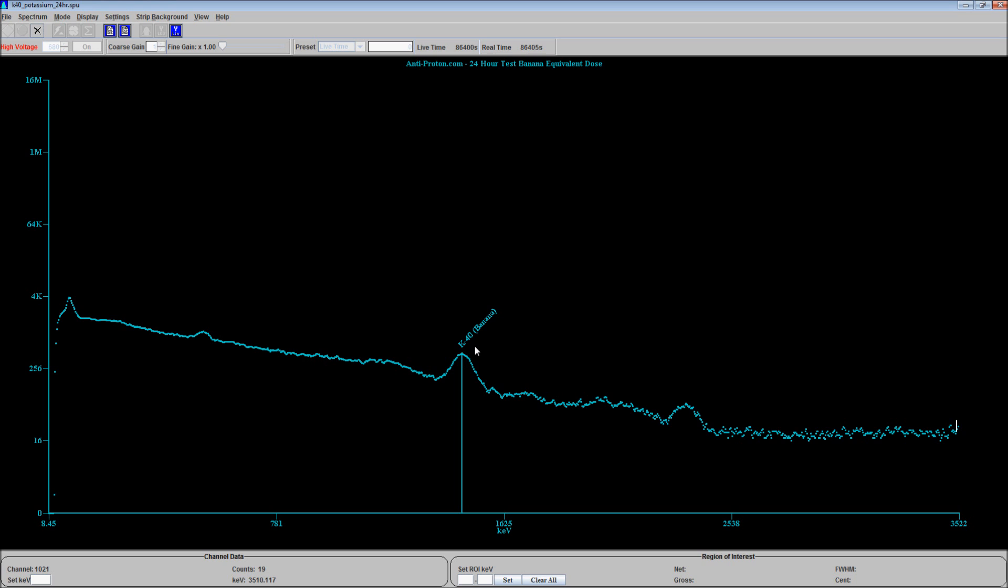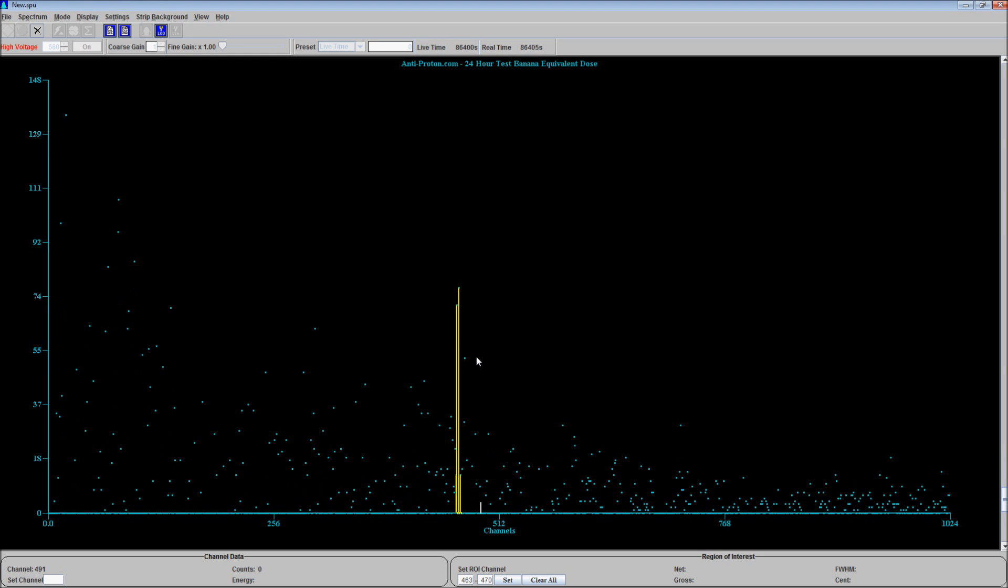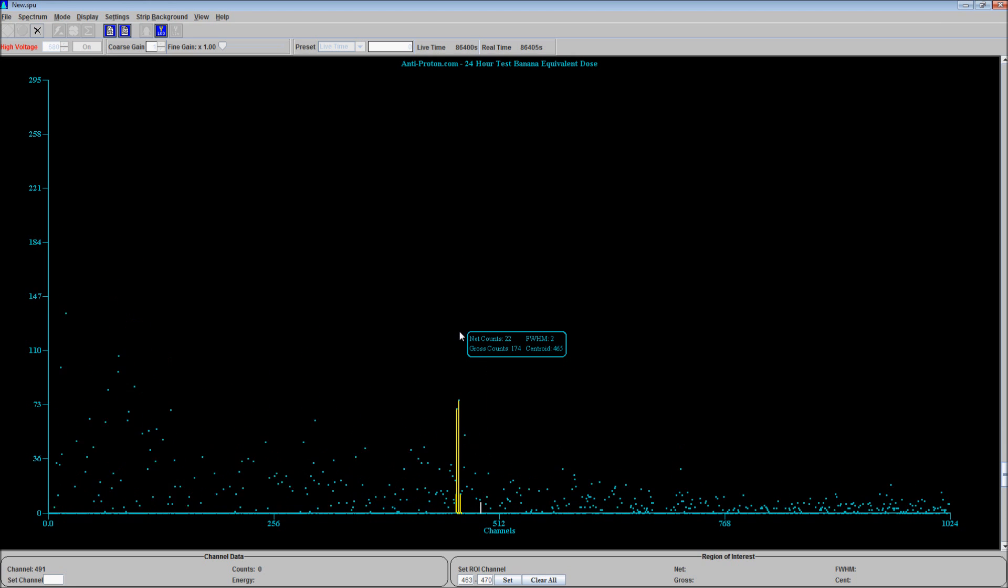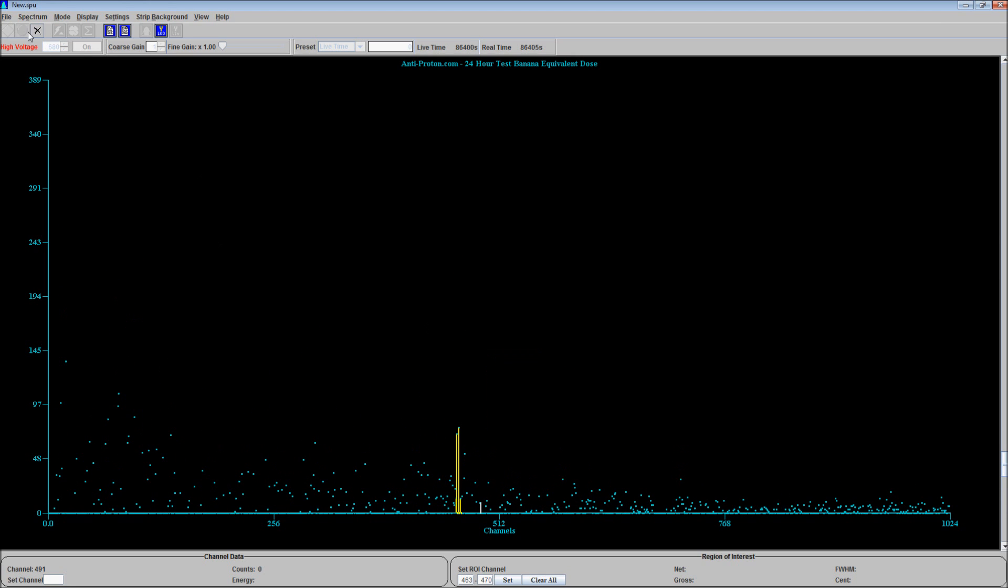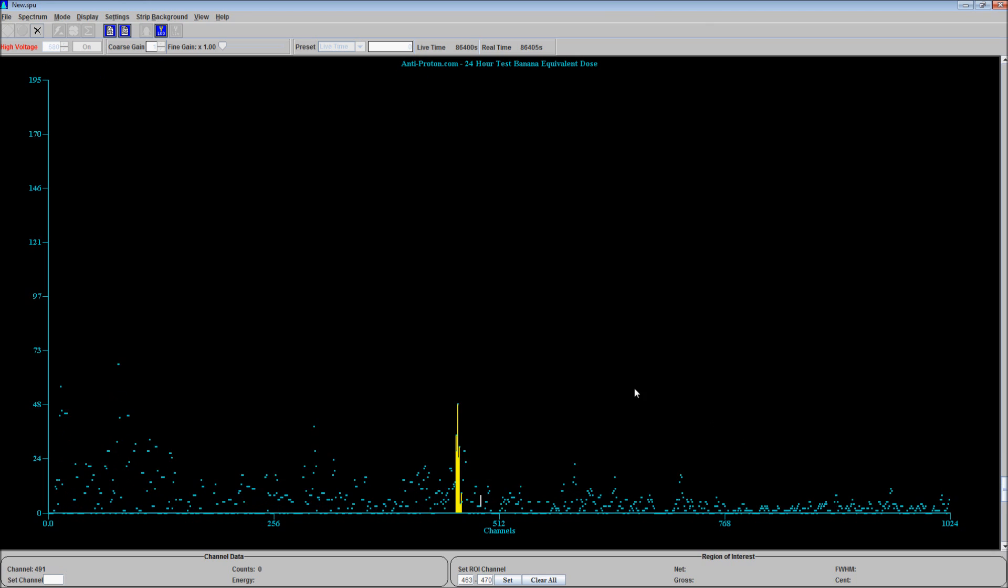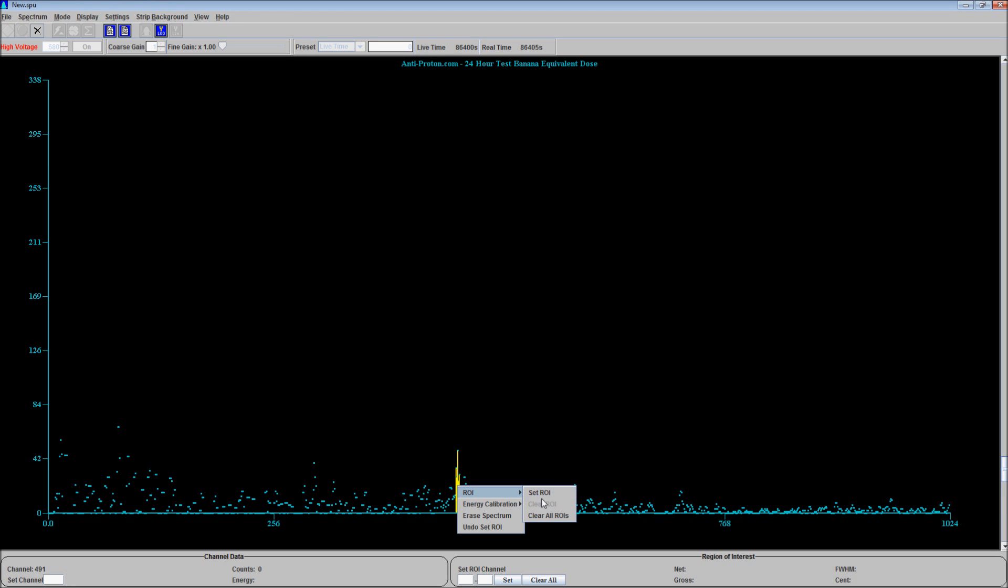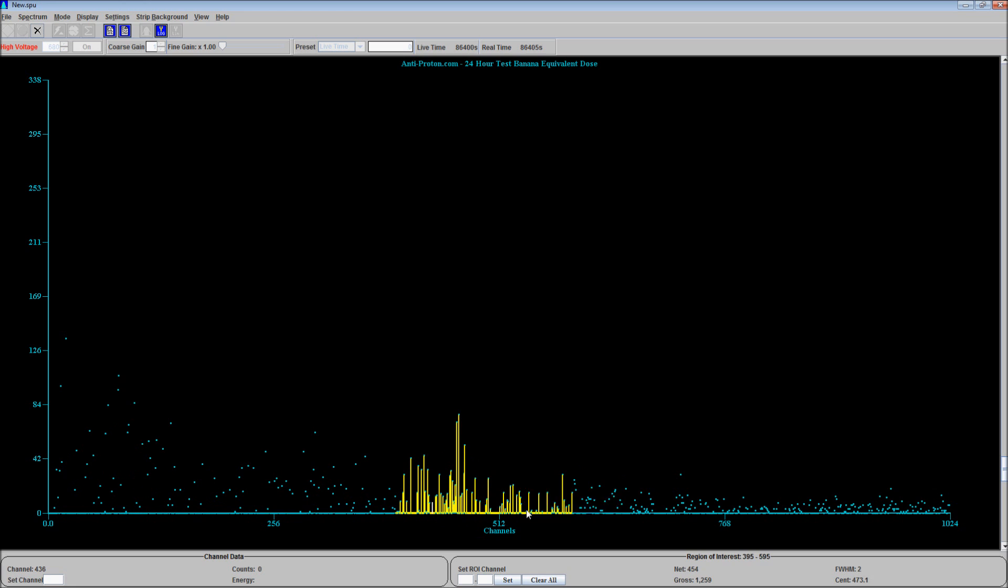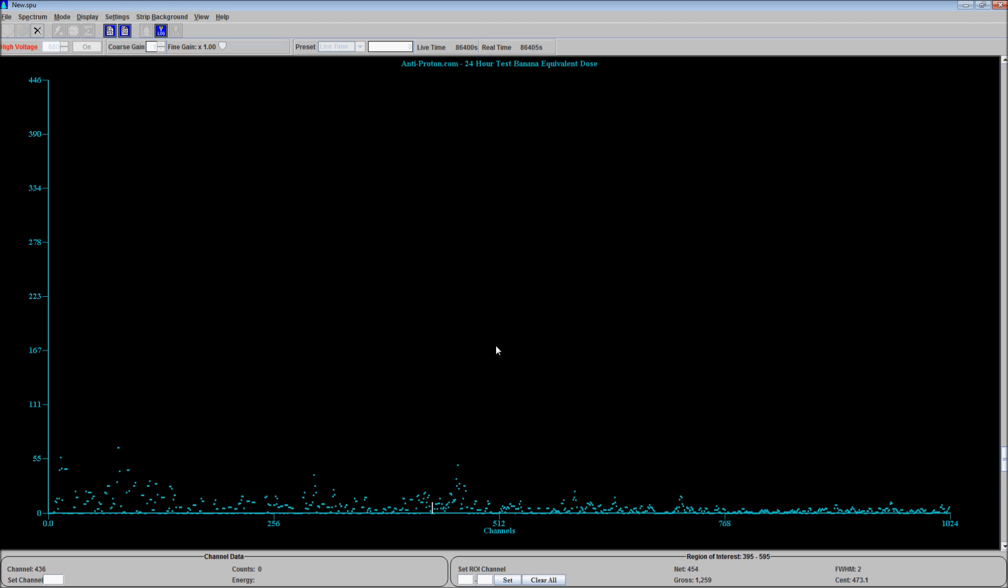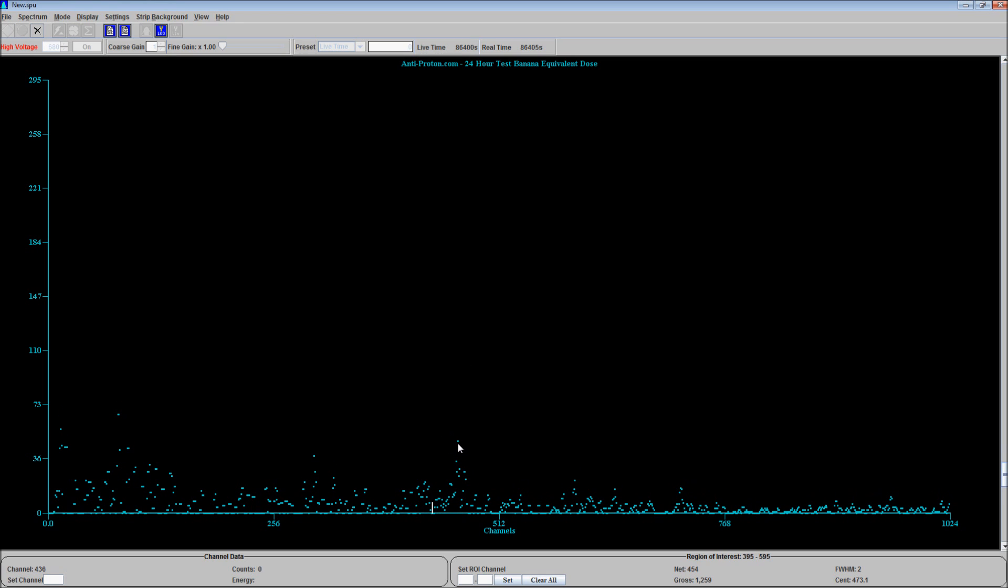So anyhow, this is what happens when you remove the background. You end up with this. This yellow, go figure, is the banana. Approximately 174 additional counts. That peak is a banana. Smooth the data a little bit. As you can see, there's a peak sitting right here for potassium-40. And I know what the rest of these peaks are over here, so I'm not too worried about them.